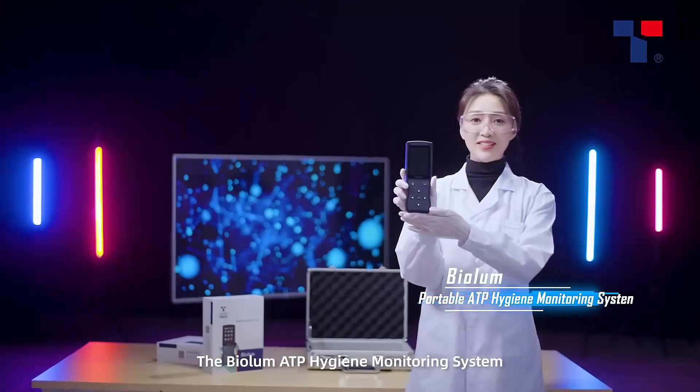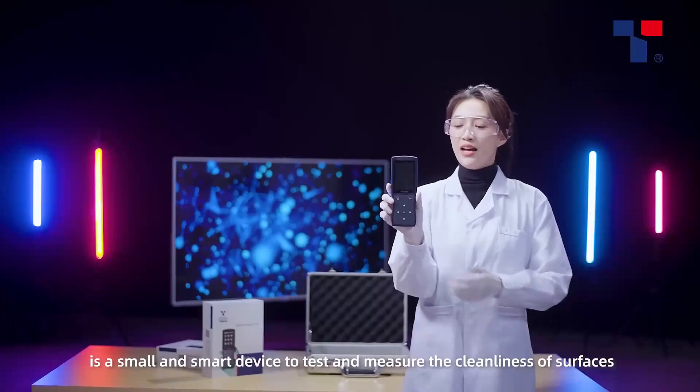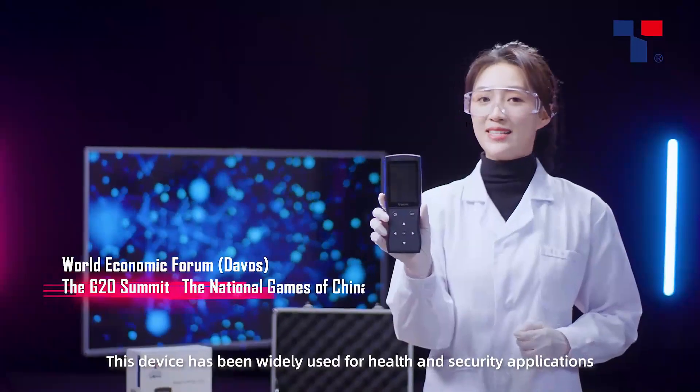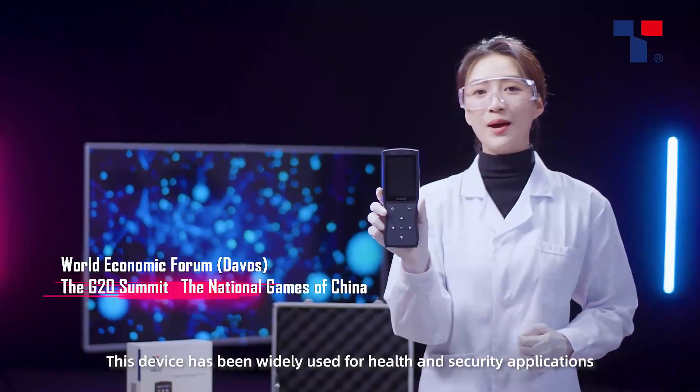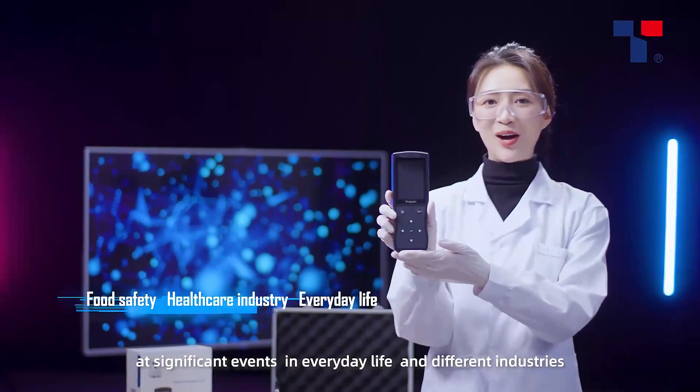The Biolum ATP Hygiene Monitoring System is a small and smart device to test and measure the cleanliness of surfaces. This device has been widely used for health and security applications at significant events in everyday life and different industries.